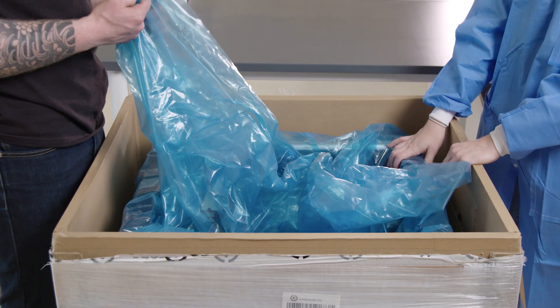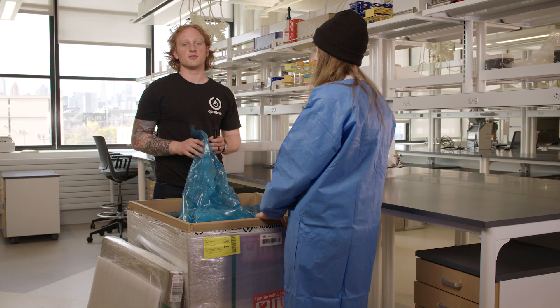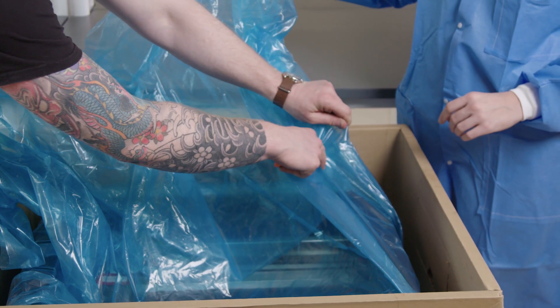Now there is a piece of plastic that houses the OT2, and this is on here so the OT2 doesn't get wet during its travel, so I will cut this open now.